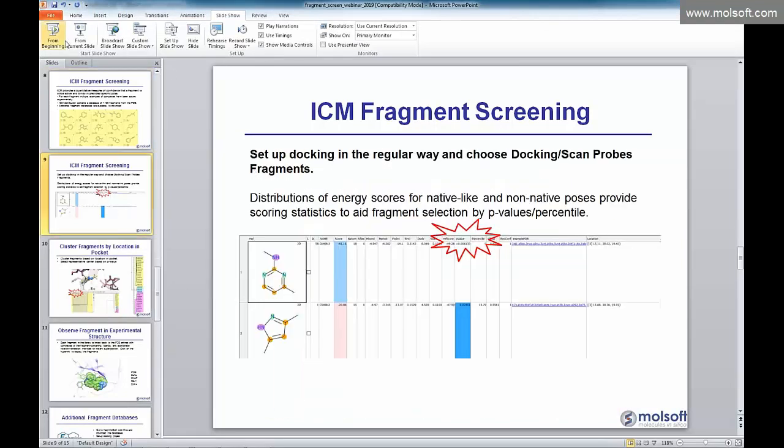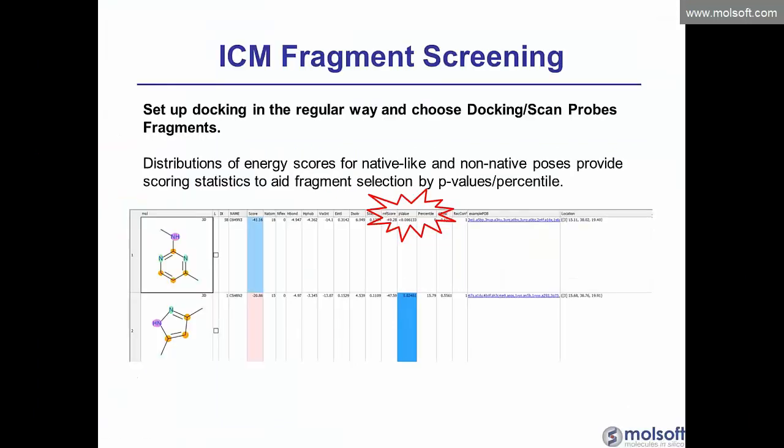Okay. So when the docking is running, you'll see a background job message at the top of the graphical user interface. You'll see a progress bar at the bottom. And when it finishes, it will automatically make you a hit list. And I'll show you this hit list.